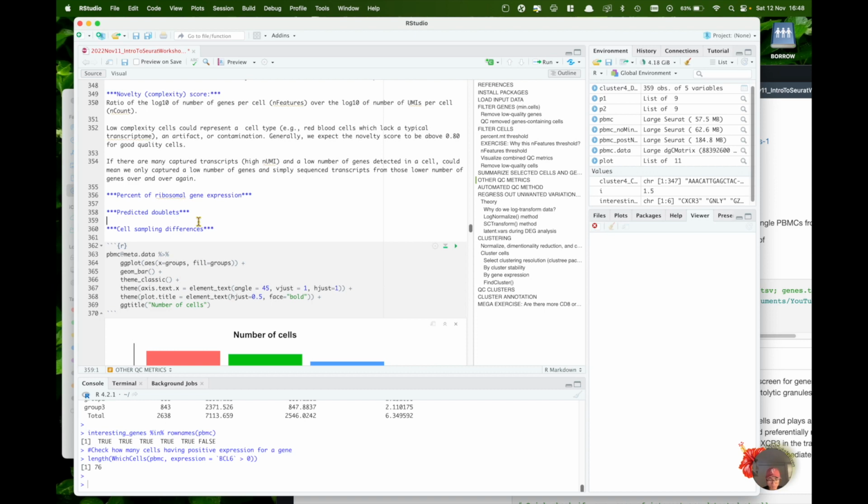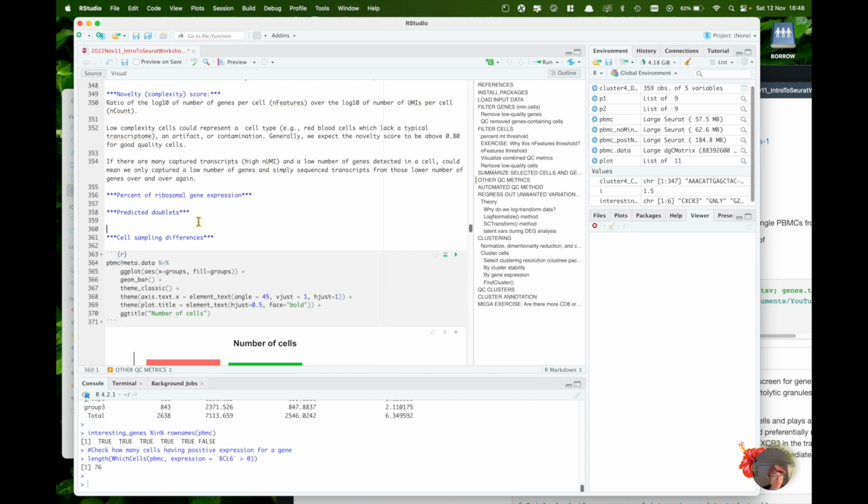The package only looks at the transcriptome, so the transcriptome might not be different enough for the model to separate out potential doublets, or to tell whether it's real and not an artifact in your data sets. But you can always check it out.